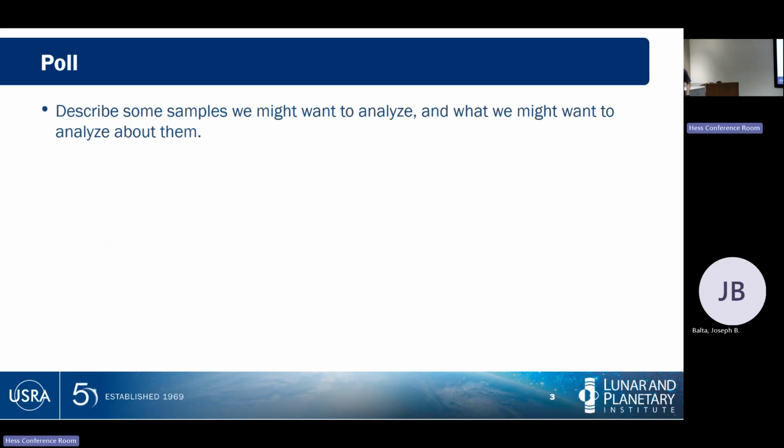All right. Crystals works for me. Okay. Let's go to the folks over there. So we're still on rocks and minerals here. What else we got? Okay, organic matter. Boom. All right.